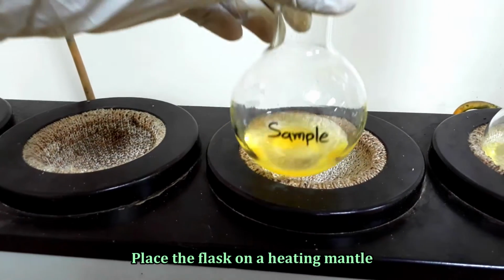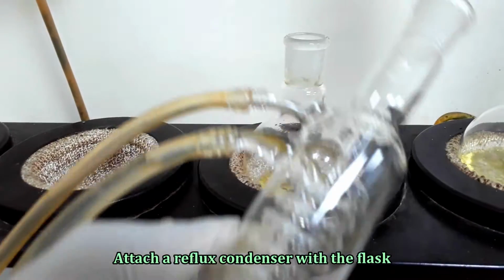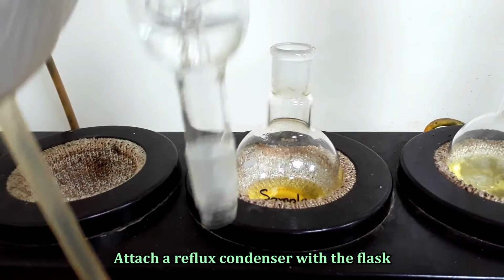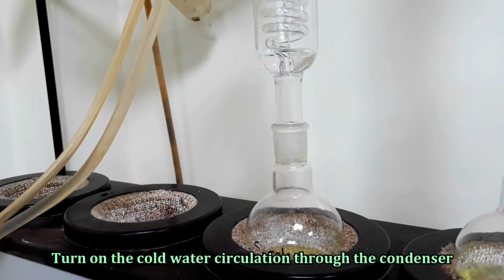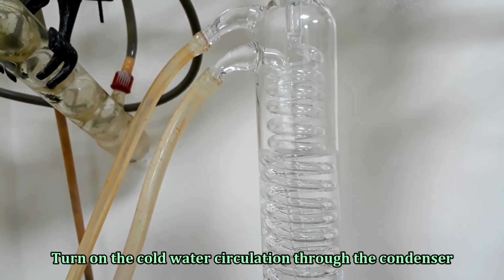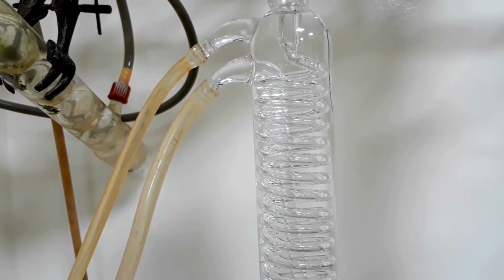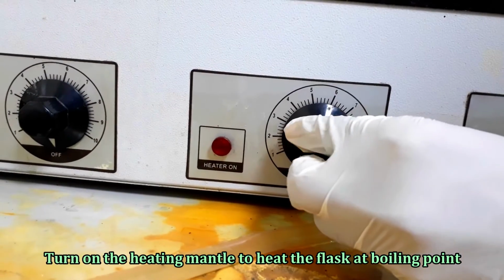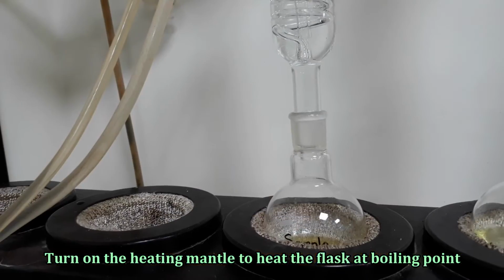Place the flask on a heating mantle. Attach a reflux condenser to the flask and turn on the water circulation through the condenser. Boil the content of the flask and reflux for 30 minutes.